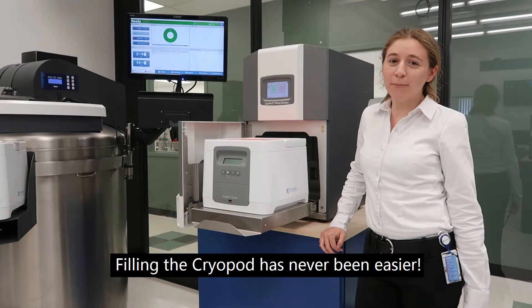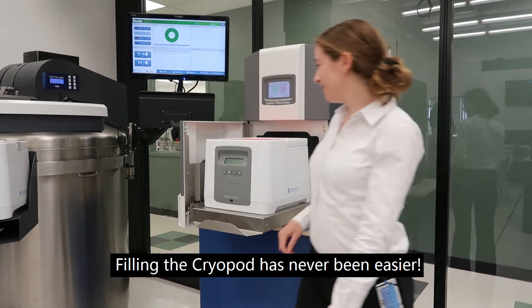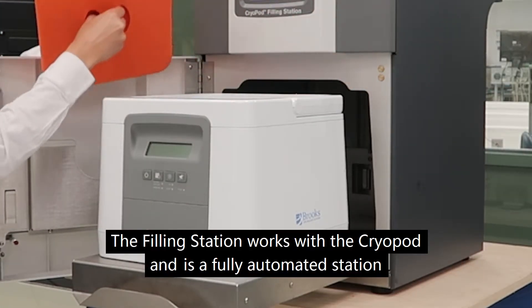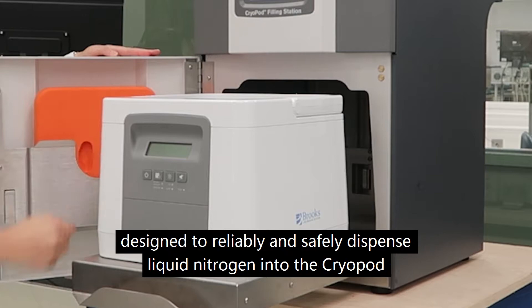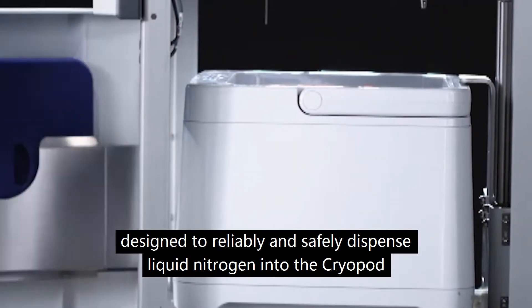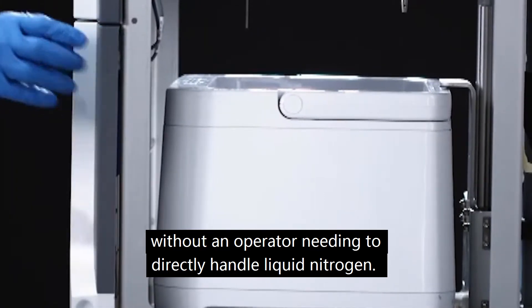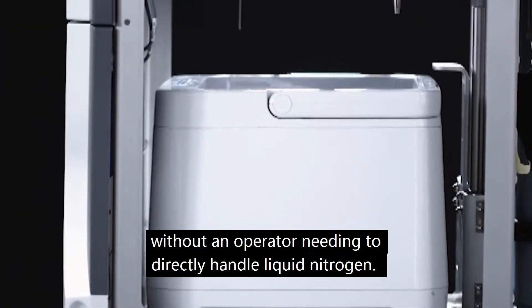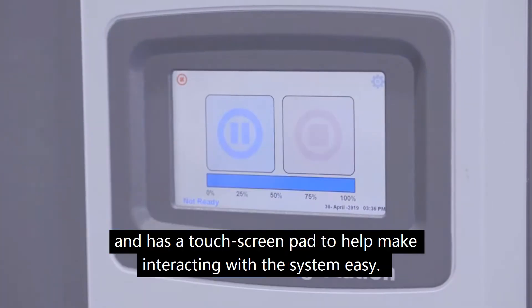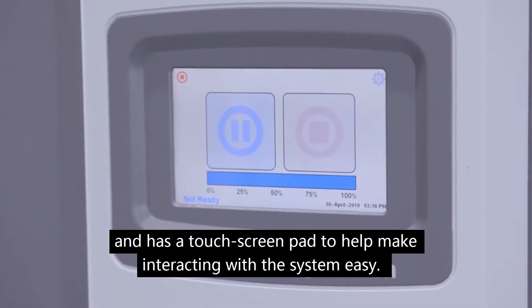Filling the cryopod has never been easier. The filling station works with the cryopod and is a fully automated station designed to reliably and safely dispense liquid nitrogen into the cryopod without an operator needing to directly handle liquid nitrogen. The filling station is user friendly and has a touch screen pad to help make interacting with the system easy.